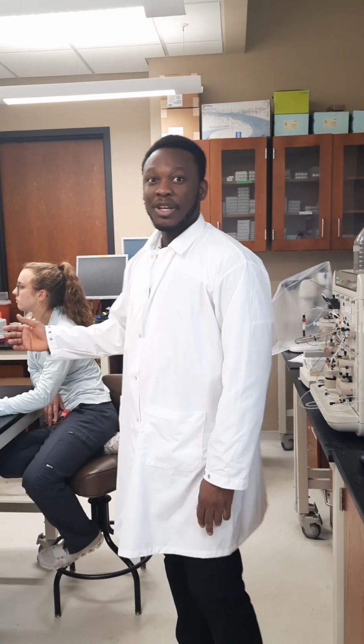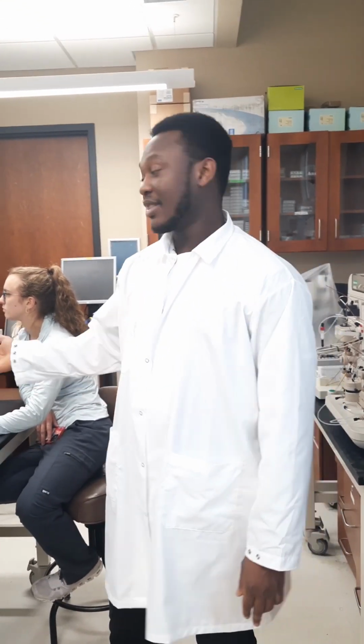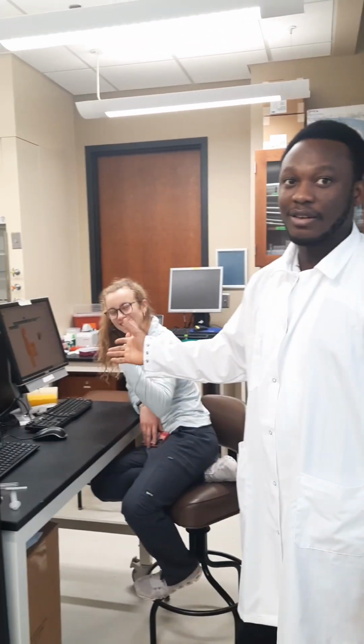And like I said, we do a lot of bioinformatic analysis, and this is one of my colleagues working on the laptop. So basically, these laptops, we use for bioinformatic analysis to identify our biosynthetic gene clusters. By combining all these tools together, we believe we'll be able to predict novel glycosylated natural products which solve the problem of antimicrobial resistance.